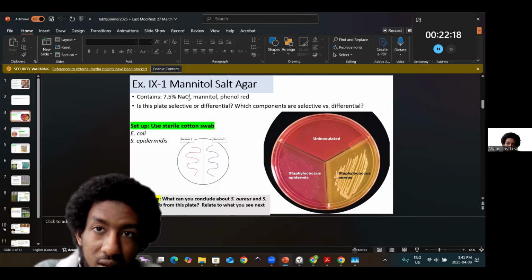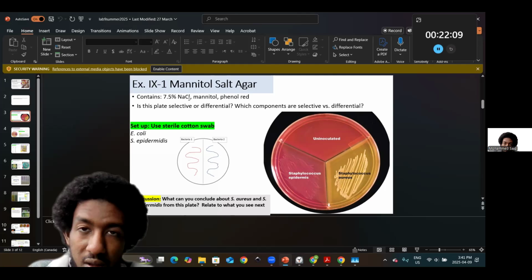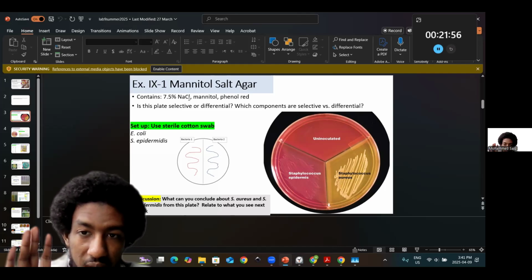The increase in salinity means that it restricts only certain bacteria to grow, i.e. it is selecting, just like the BLA gene, resistance for ampicillin for transformation of HB101 E. coli. We're selecting here for only osmotolerant bacteria.